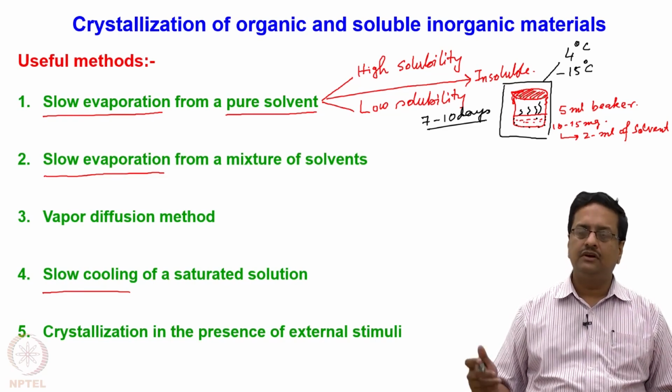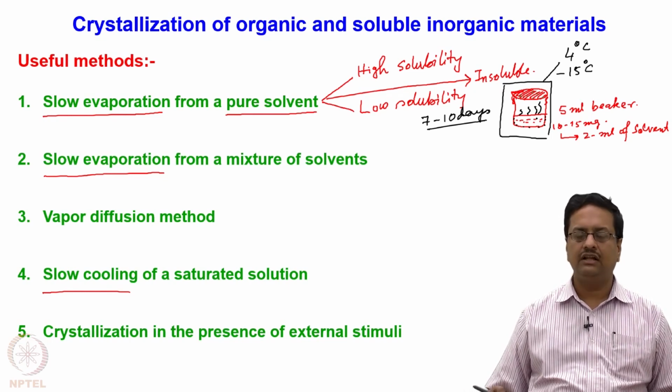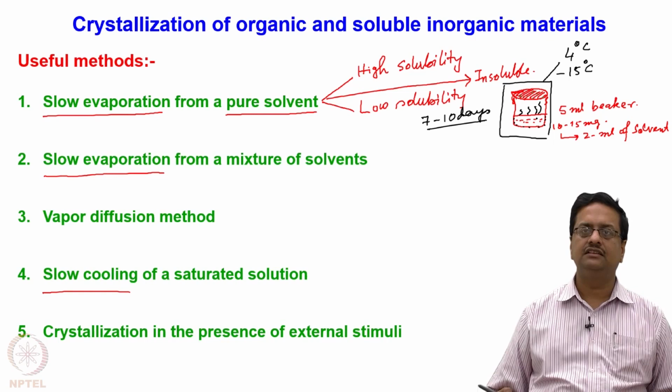This method works for a large number of different compounds where a single solvent is good enough for crystallizing them.